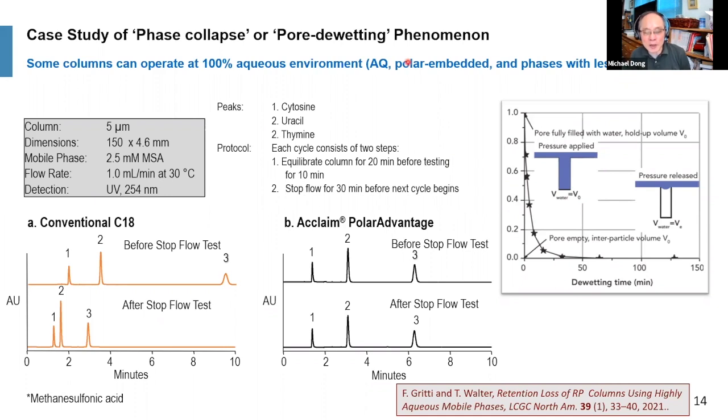The better terminology is called pore de-wetting, right? Actually, Fabrice Gritti, he's a very excellent theoretical chromatographer. He published a lot of papers. I'm a big fan of Fabrice, right?